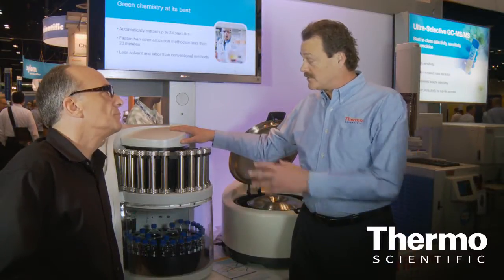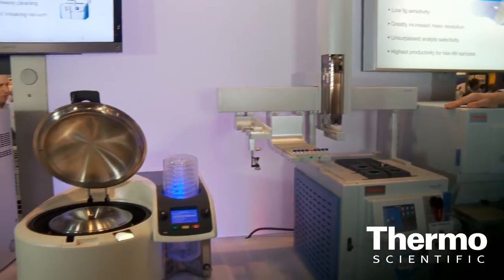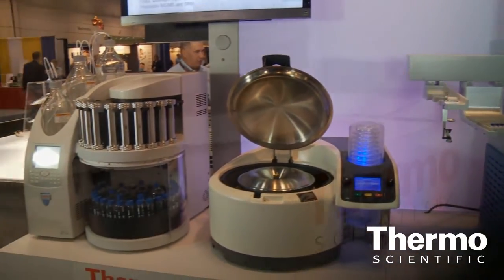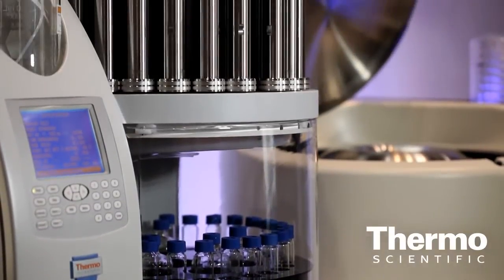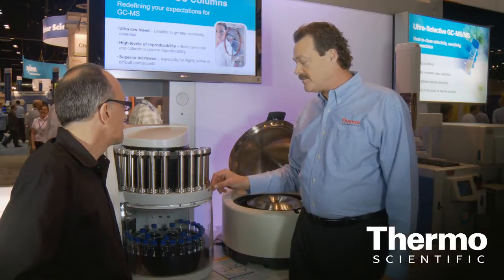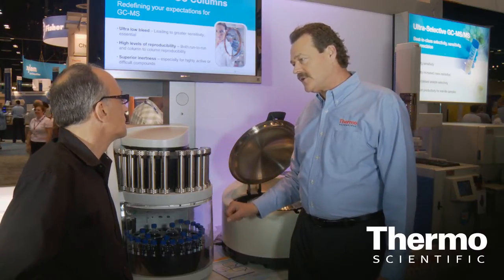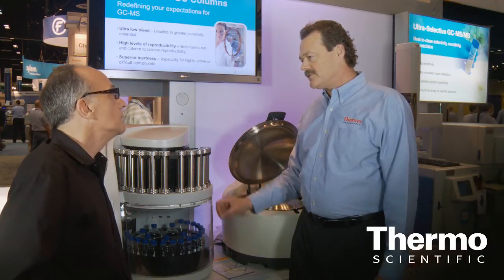So talk about our unique approach. The sample preparation workflow starts here with the ASE, or accelerated solvent extraction. We call it the ASE 350. This is a completely automated process for extracting samples, so we can prepare a sample in a matter of minutes — say 15 minutes — as opposed to 8 or 10 hours for conventional methodology. Not only that, we can prepare that sample with very small volumes of solvent: a 90% reduction in solvent consumption for a single sample.